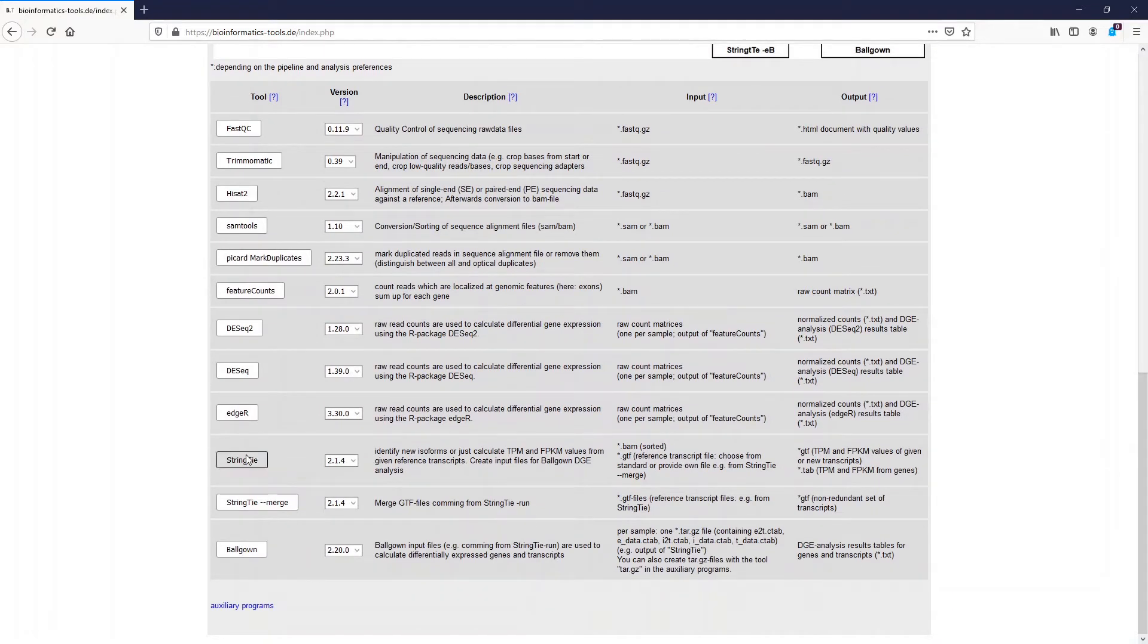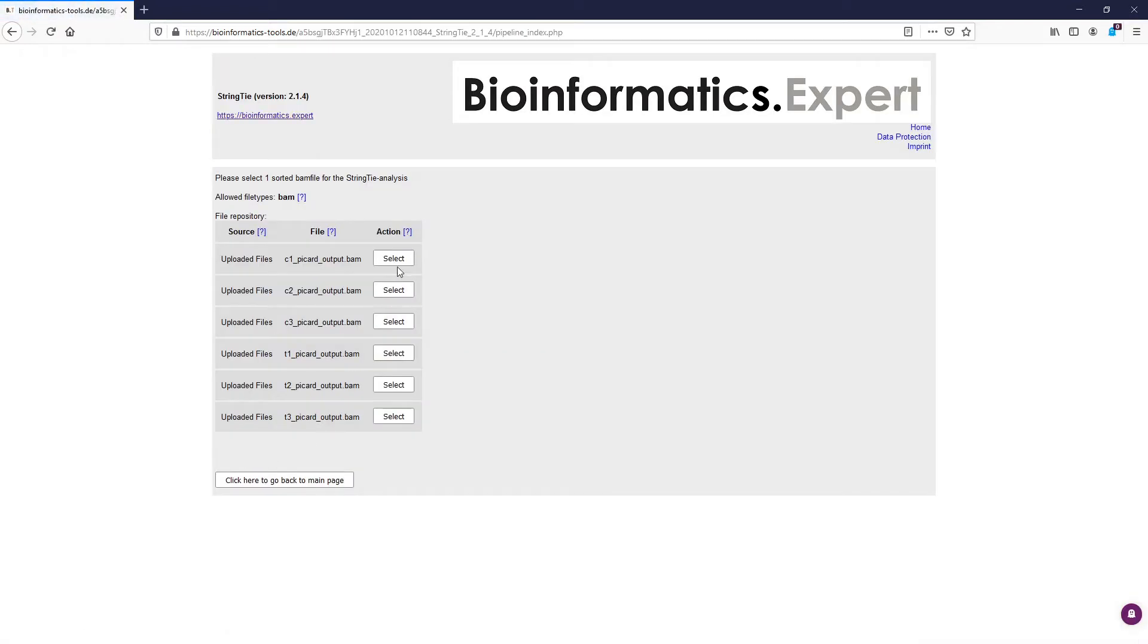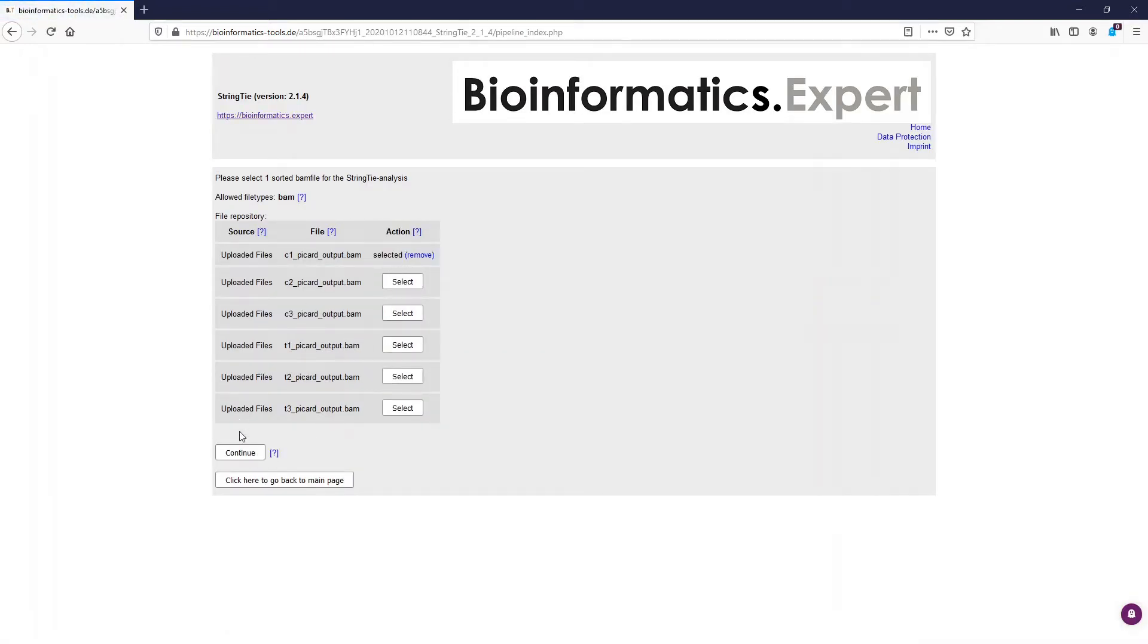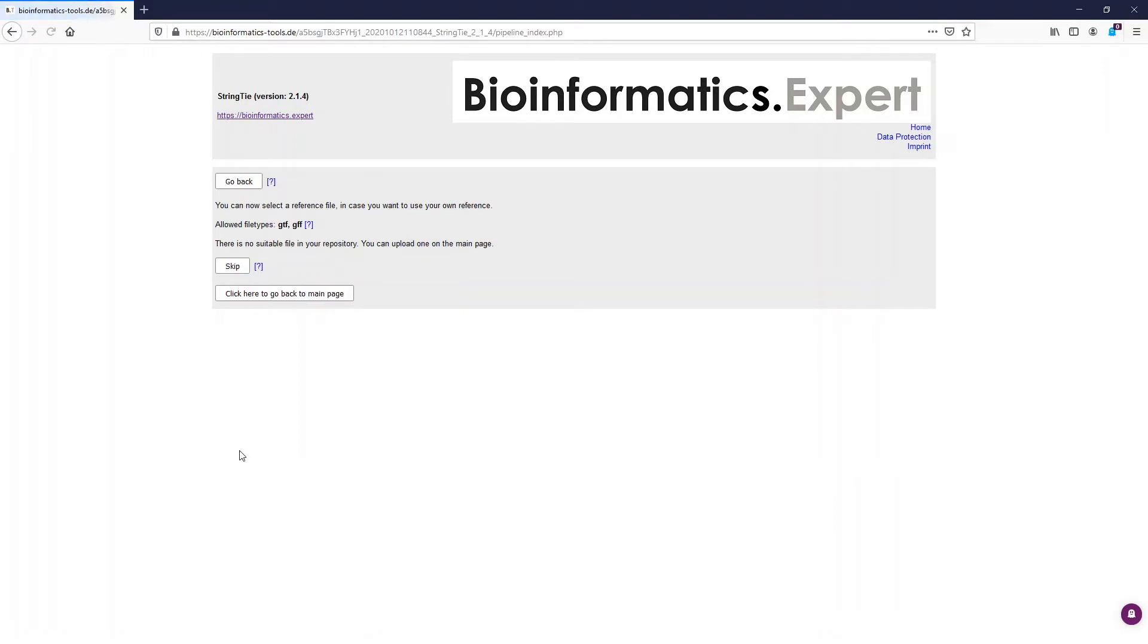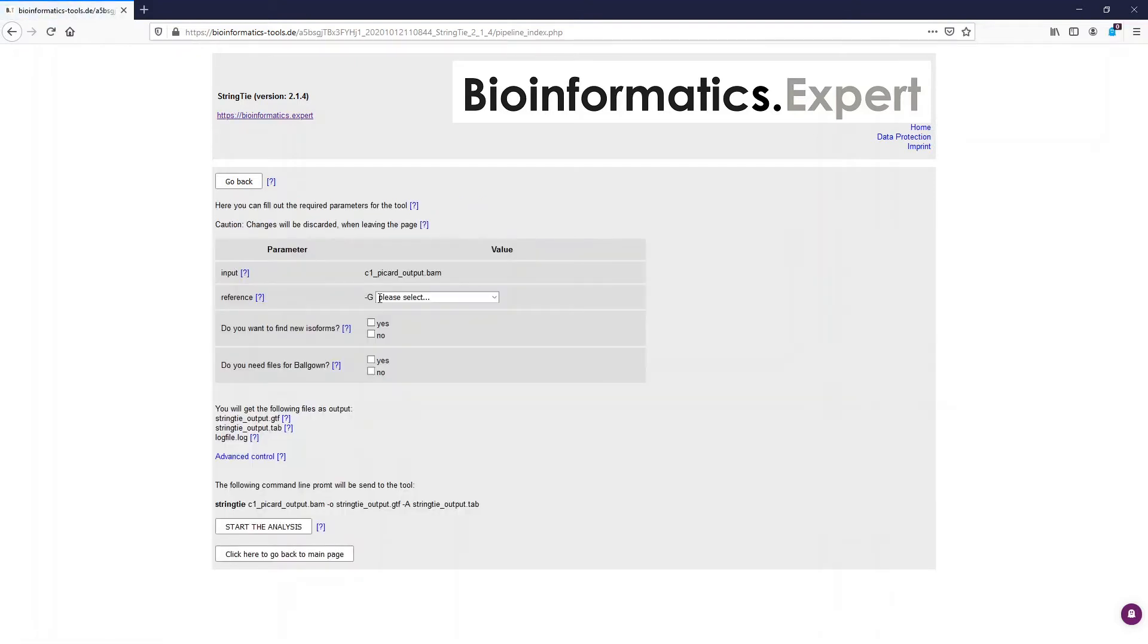We start StringTie easily by clicking the button in the table. Now we have to select the BAM file which we want to analyze. On the next page we can now select if we want to use an own reference or if we want to use a reference provided by the program. In the first part we skip it and use a provided reference. We can select it in the input table here.